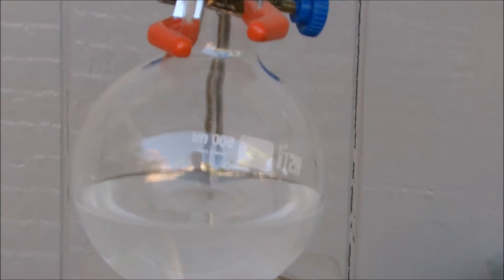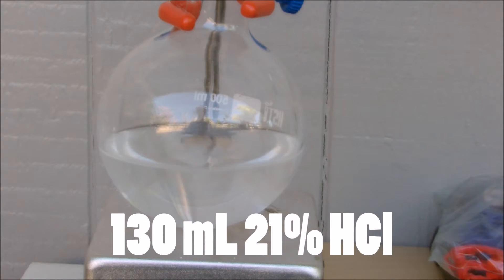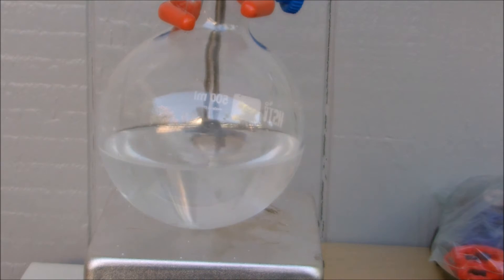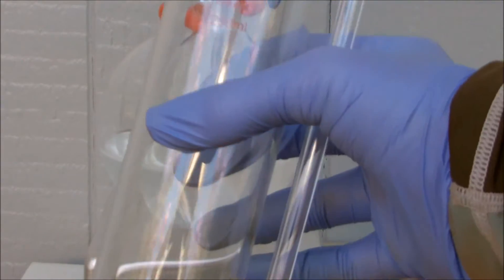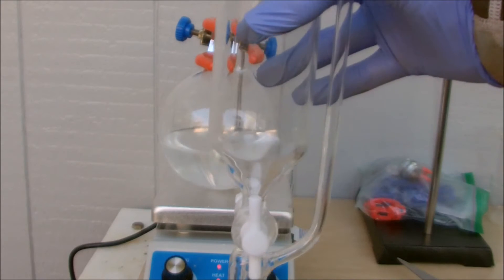Now we're going to add 130 milliliters of 21% hydrochloric acid. You can use any percentage you want. Mine just happens to be this, so you probably will need less if you use the 35%. I'm going to put that into this 250 milliliter pressure equalizing addition funnel. Let's measure that out now.